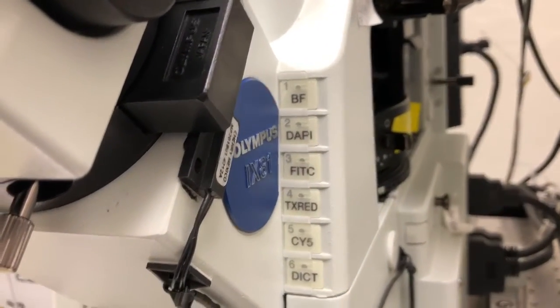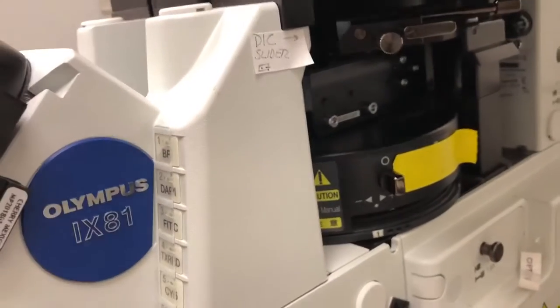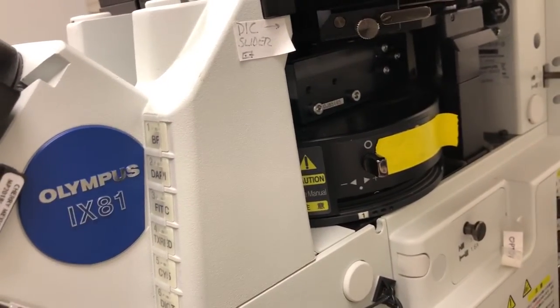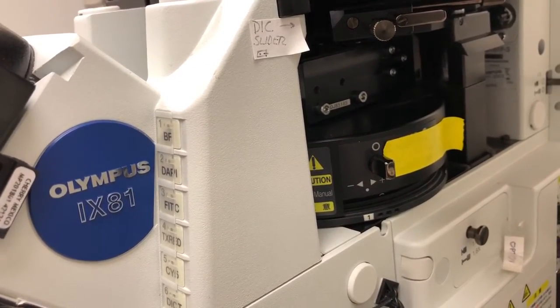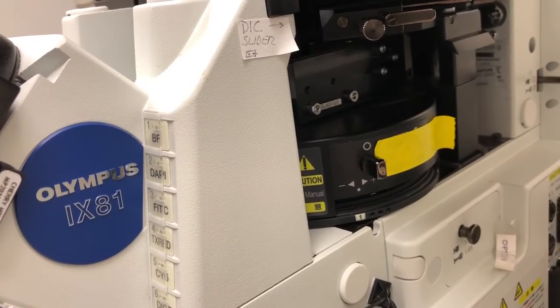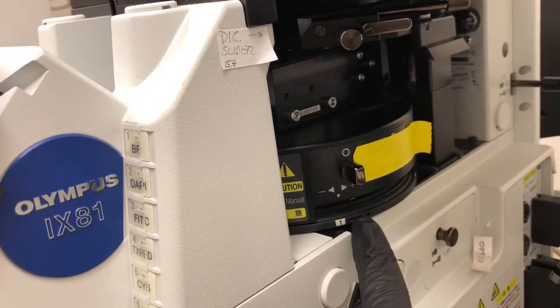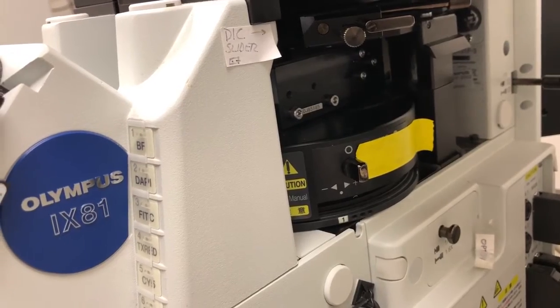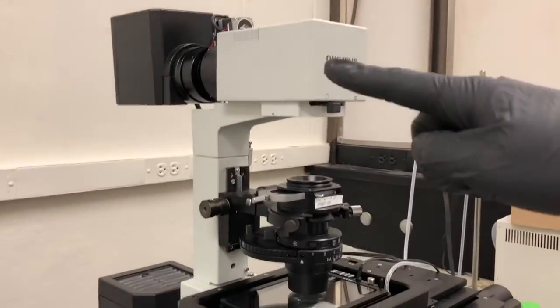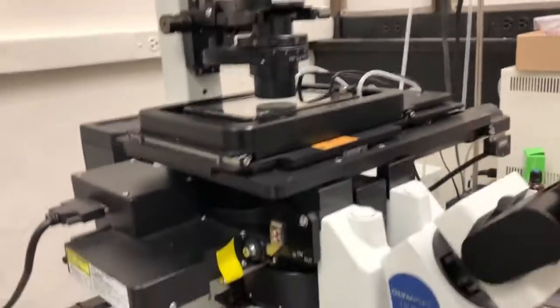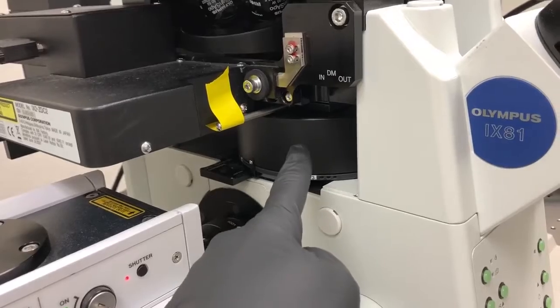So typically for a quick and dirty brightfield, we will use position one. Note that position one is also the position in which we're going to place things if we need to actually image using the spinning disk confocal. Position one is where it is right now, so we're going to leave that as it is. So far, what we have is light reaching the sample and then going through the right cube beneath the sample.